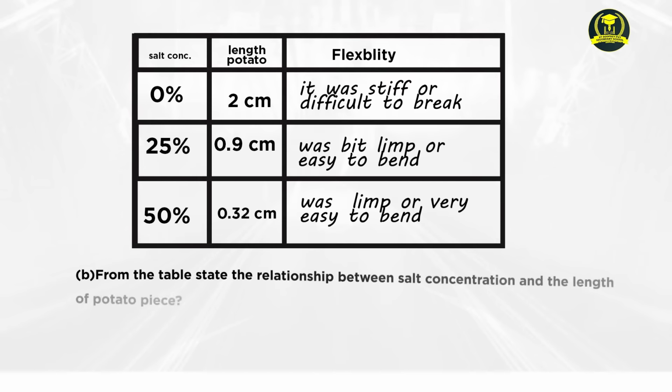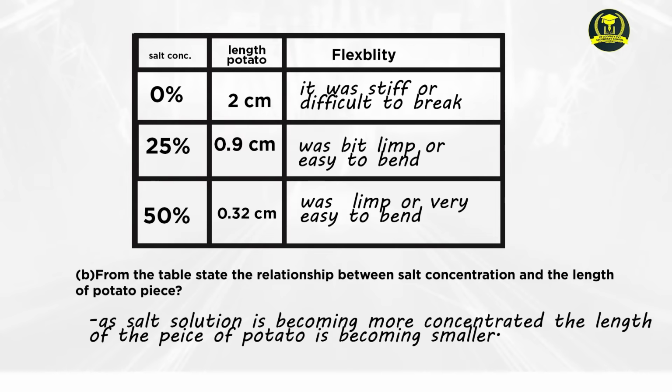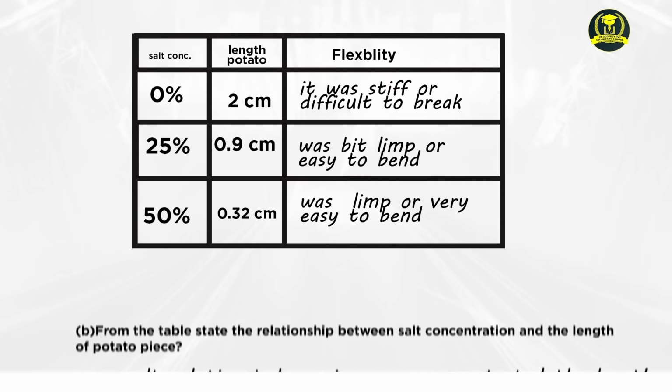Question B. From the table, state the relationship between salt concentration and the length of the potato piece. As salt solution is becoming more concentrated, the length of the piece of potato is becoming smaller.